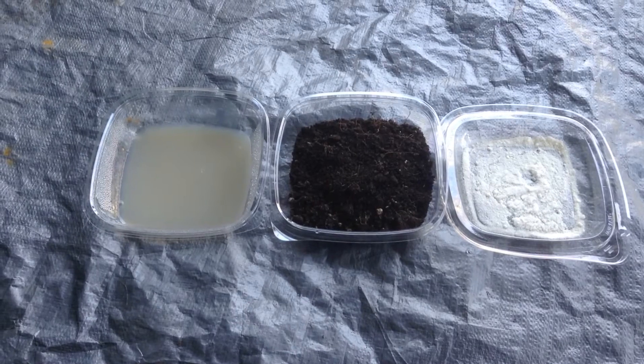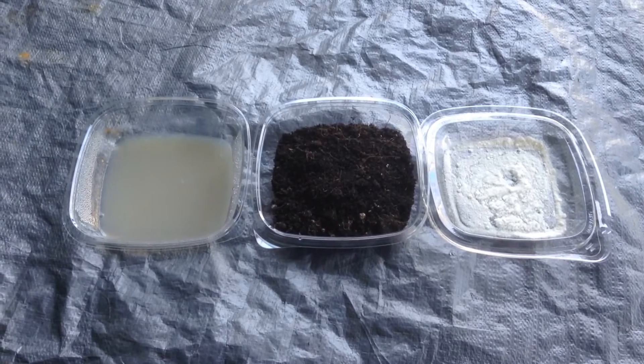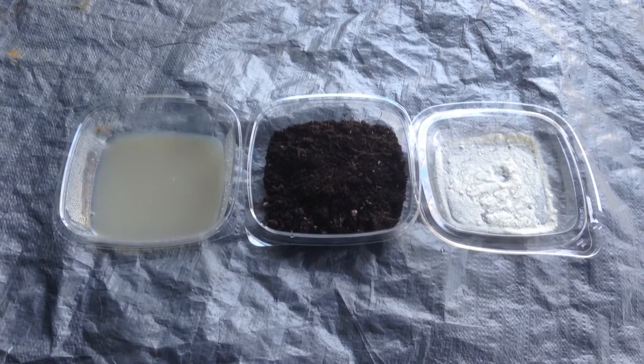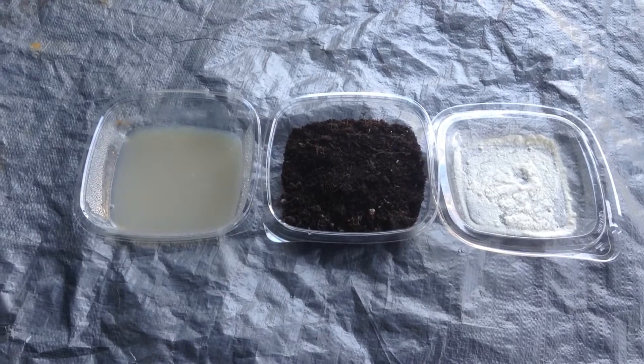Now, when reintroduced to the soil, mycorrhizal needs to be applied directly to the root system of a plant, which can be done by sprinkling on a root system before you put it into the ground, or sprinkling underneath where the root ball is going to be introduced.